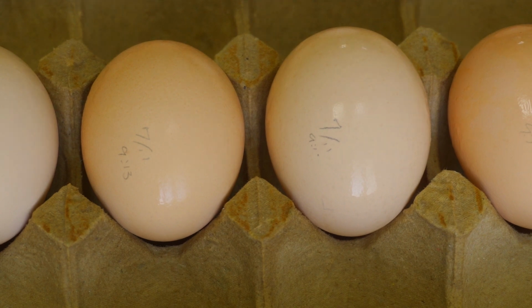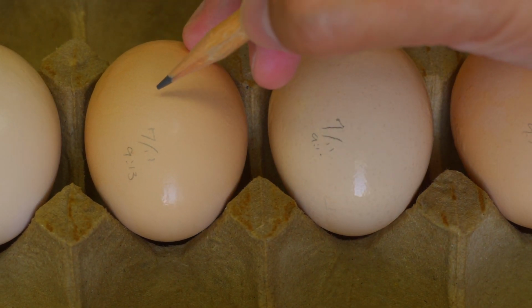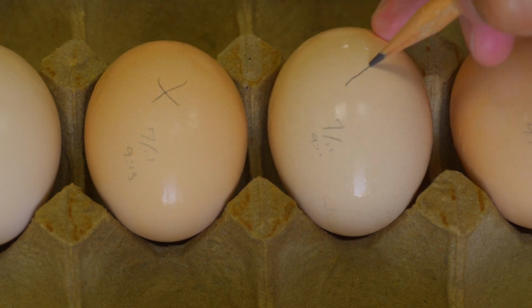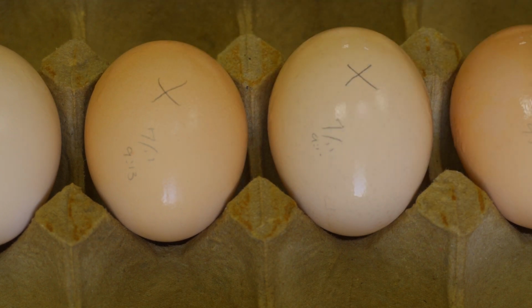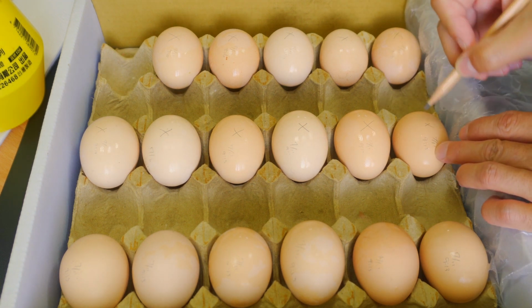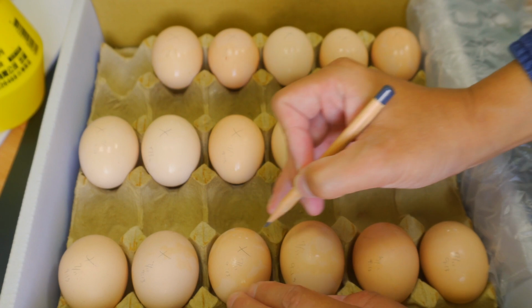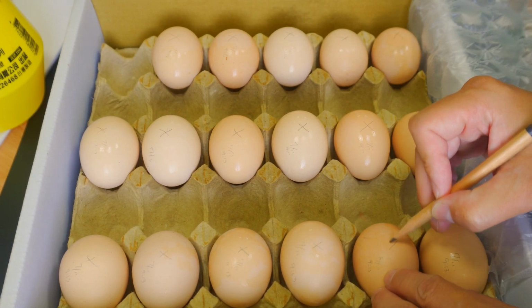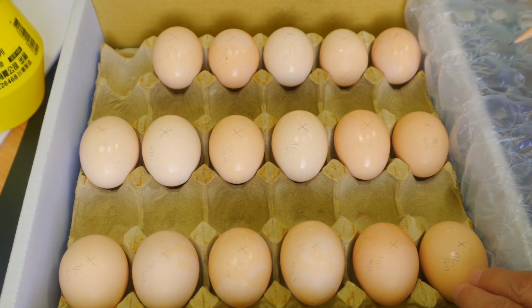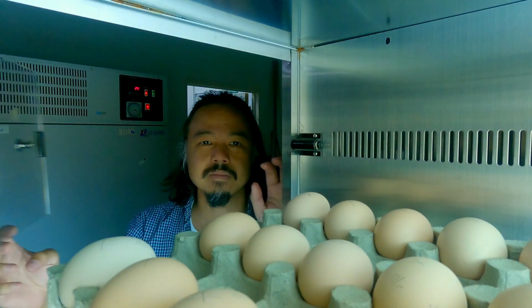But working with biological material like eggs, there's always a bit of variability. The guide mentions a challenge there. Yeah. Fertilization doesn't always happen at the exact same moment. Development might start slightly differently, even in eggs from the same batch. So you can't just rely on one egg. Definitely not. The practical solution: you prepare multiple specimens, incubate several eggs. That way you boost your chances of getting at least a few embryos at exactly the stage you need. Redundancy is your friend here.